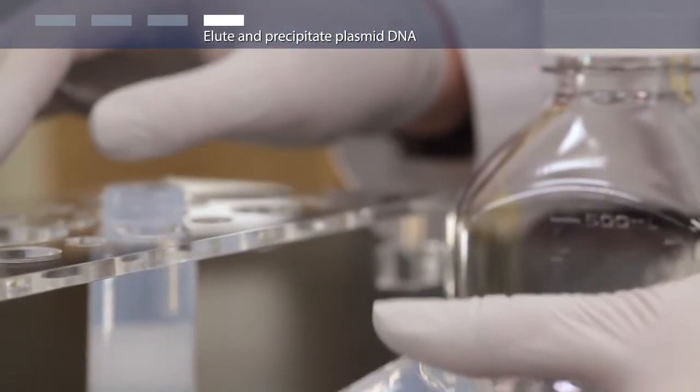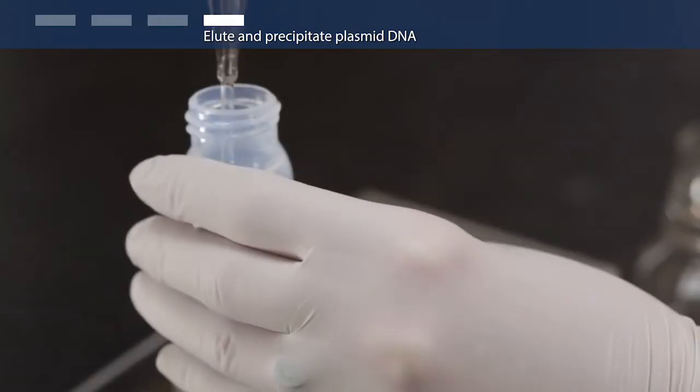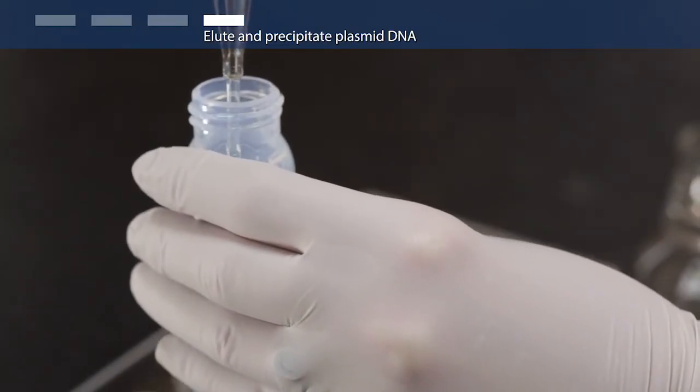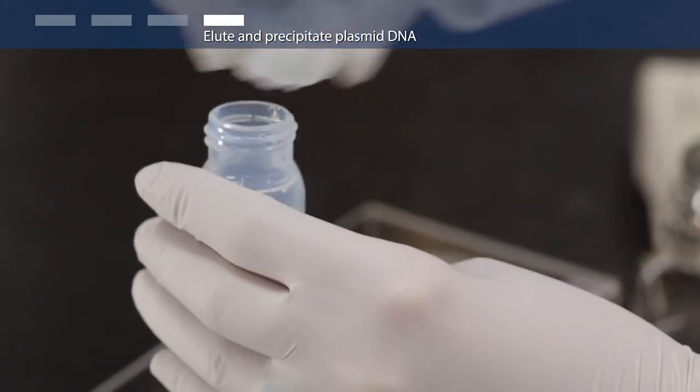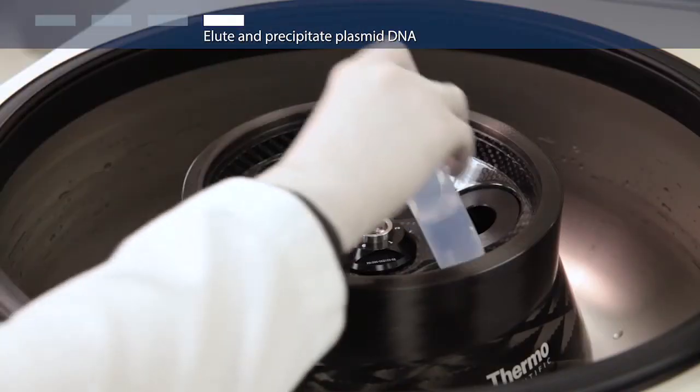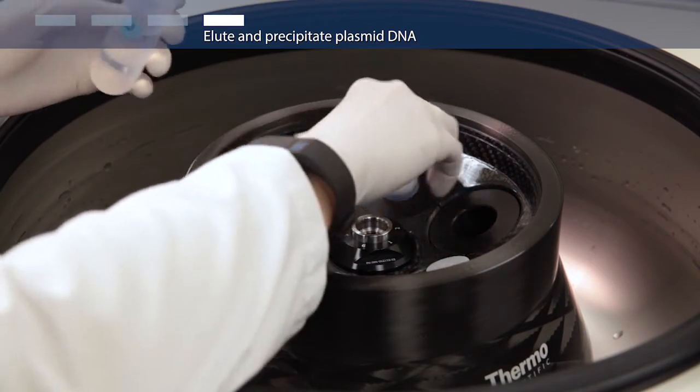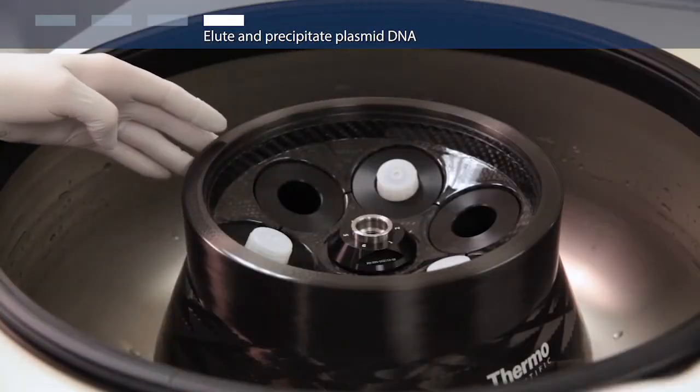Then discard the supernatant. Wash the plasmid DNA pellet in 20 milliliters 70% ethanol. Centrifuge at greater than 12,000 times G for 10 minutes at 4 degrees Celsius.